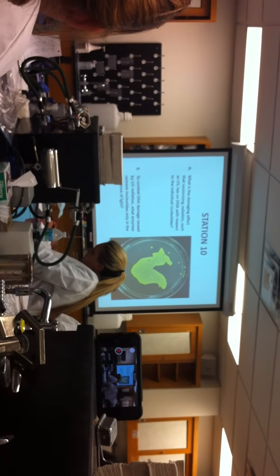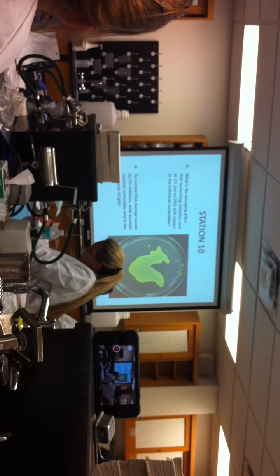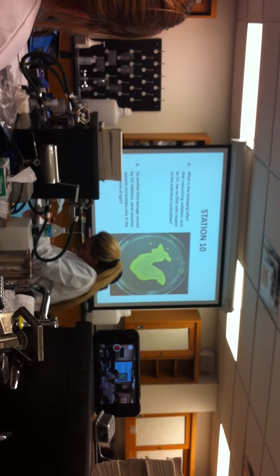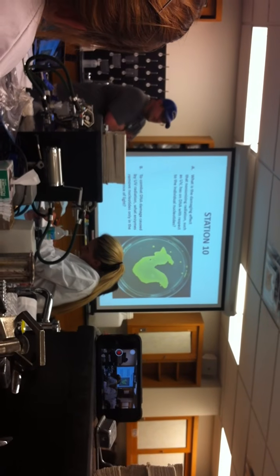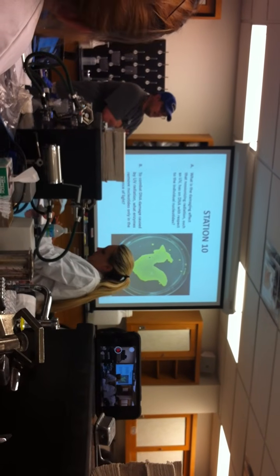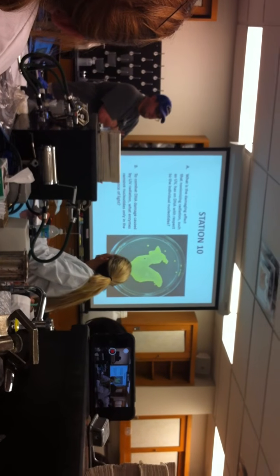We just talked about this. If you have bacteria and they're surviving ultraviolet light, what are they doing? They produce a pigment. What does UV light do to DNA? Causes DNA damage or double-stranded break. Actually, this is thymine dimers.